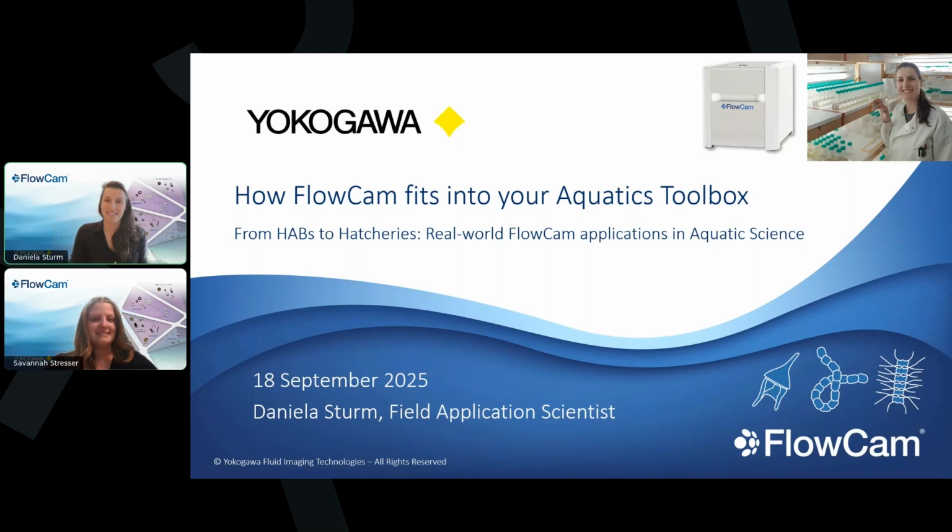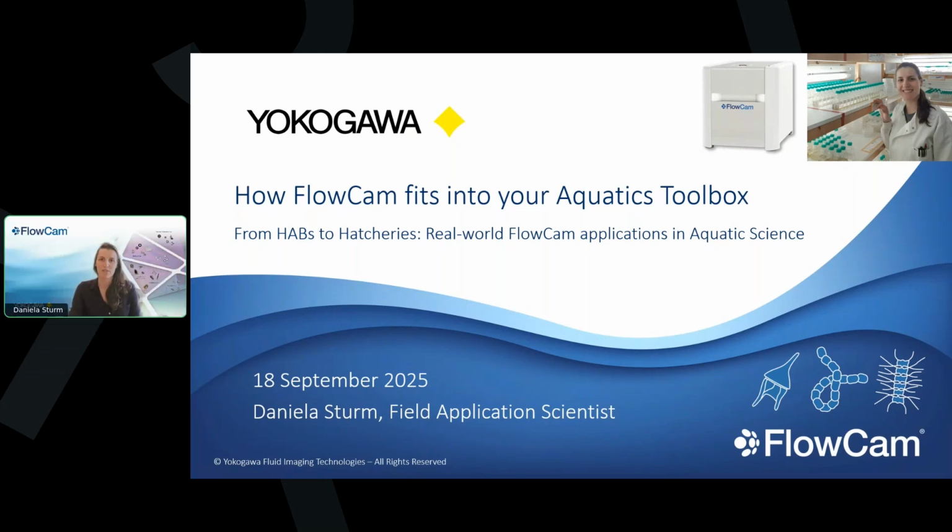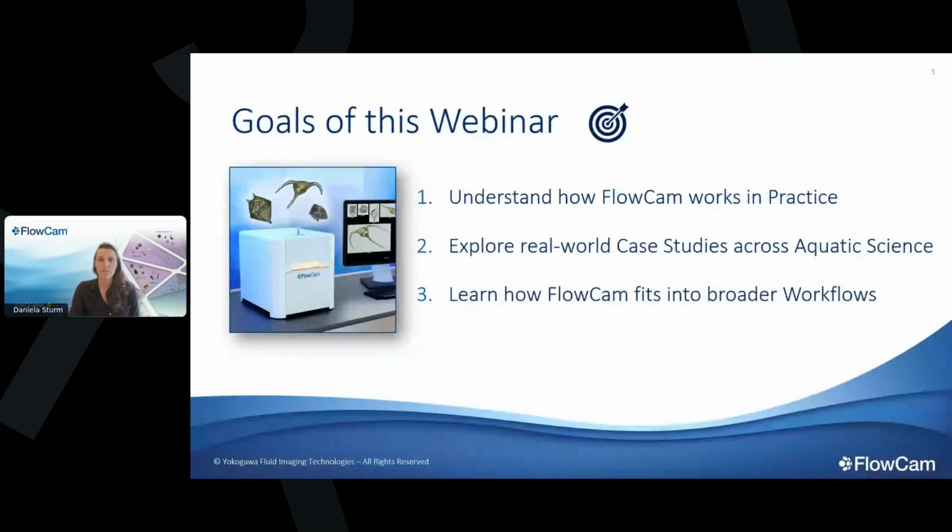So let's get started. In this webinar, as Savannah said, I'm going to be presenting an overview of FlowCam for aquatic applications and how flow imaging microscopy can fit into broader workflows. So before we dive in, I just want to give you a quick overview of what we're going to be covering today. So first, we'll look at how FlowCam actually works in practice.